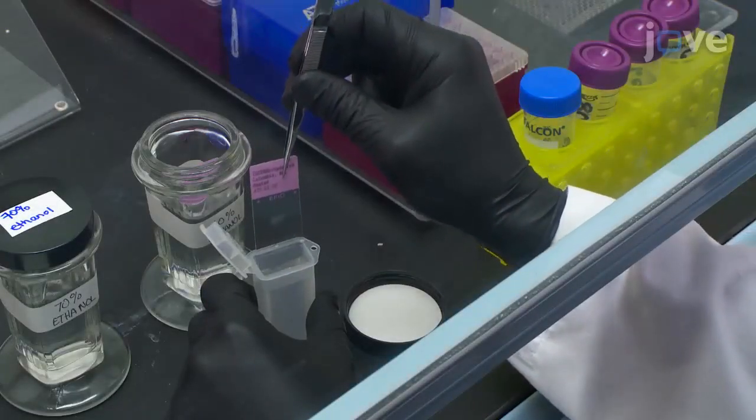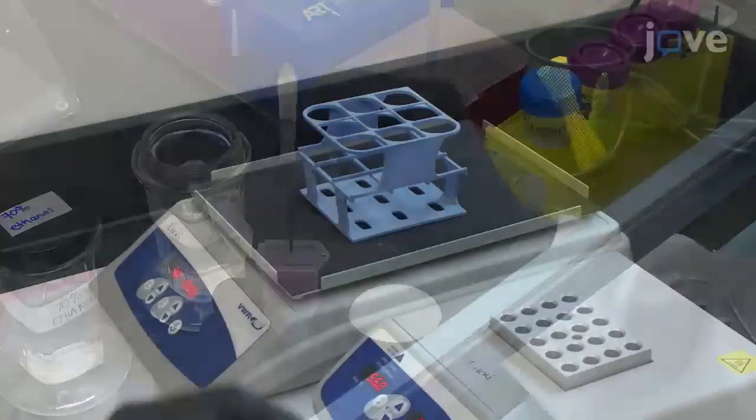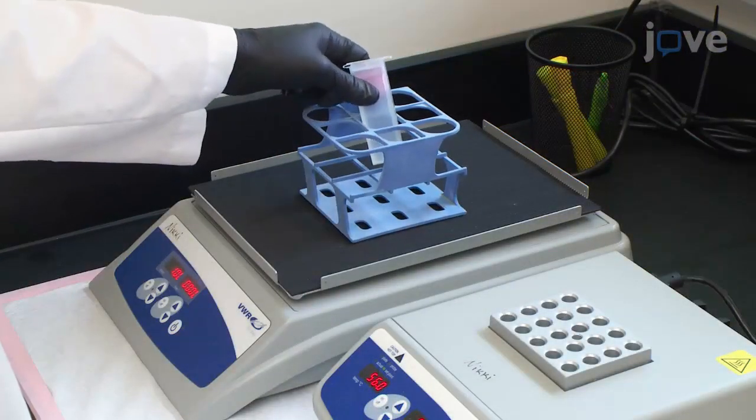First, transfer the slides to a sterile slide mailer with 18 milliliters of PBS. Then wash the slides for 5 minutes at room temperature.